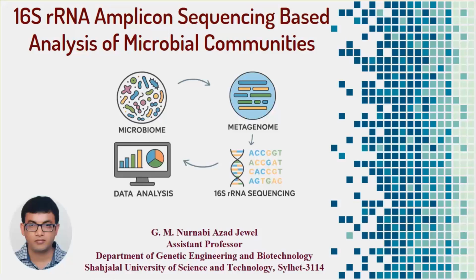Hello and welcome. Today we are going to demonstrate how to download public raw NGS data from the NCBI SRA database using the direct manual download method.